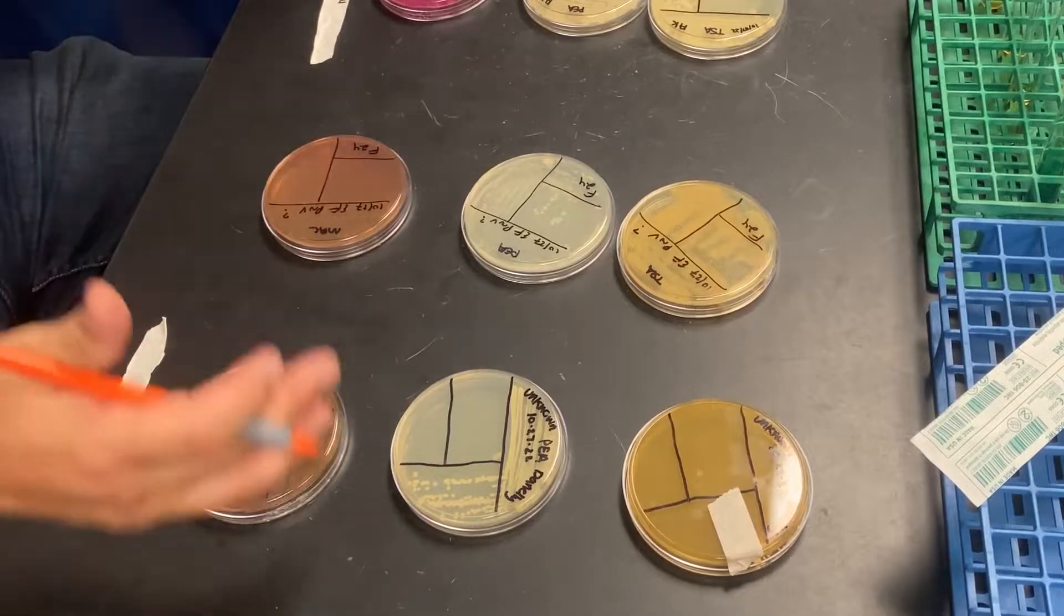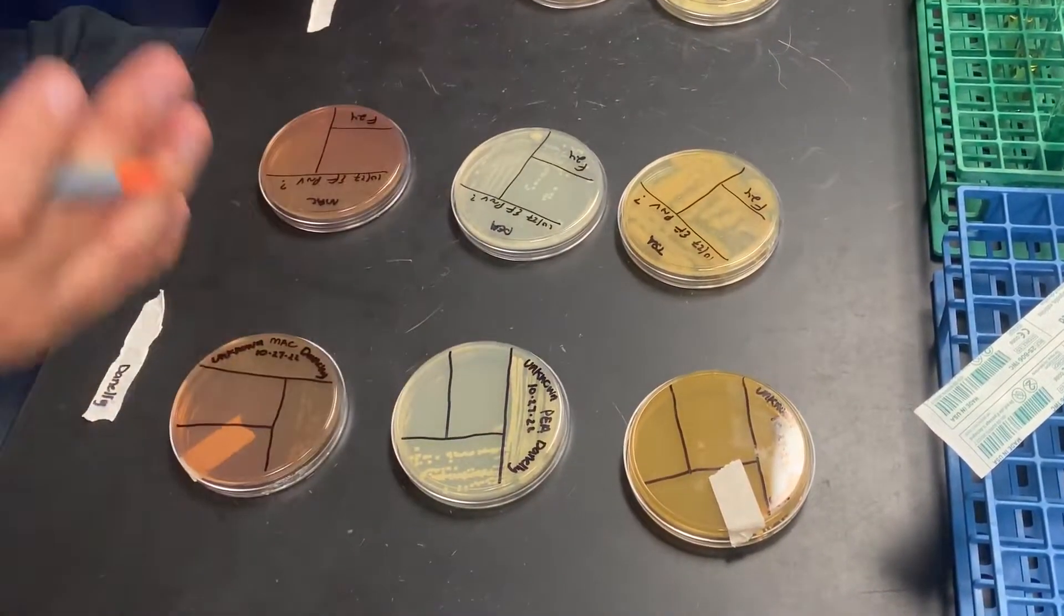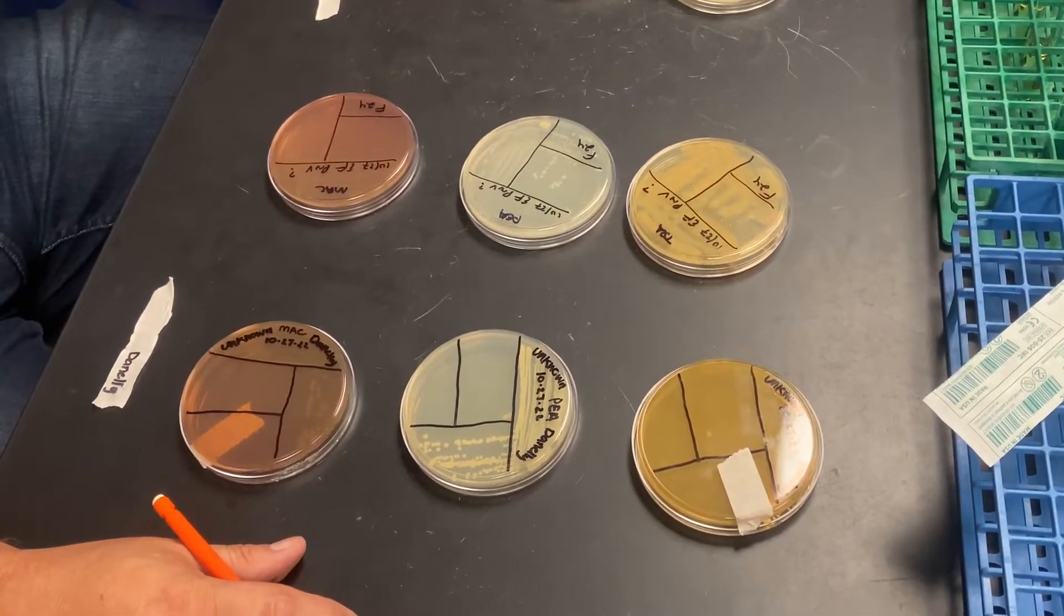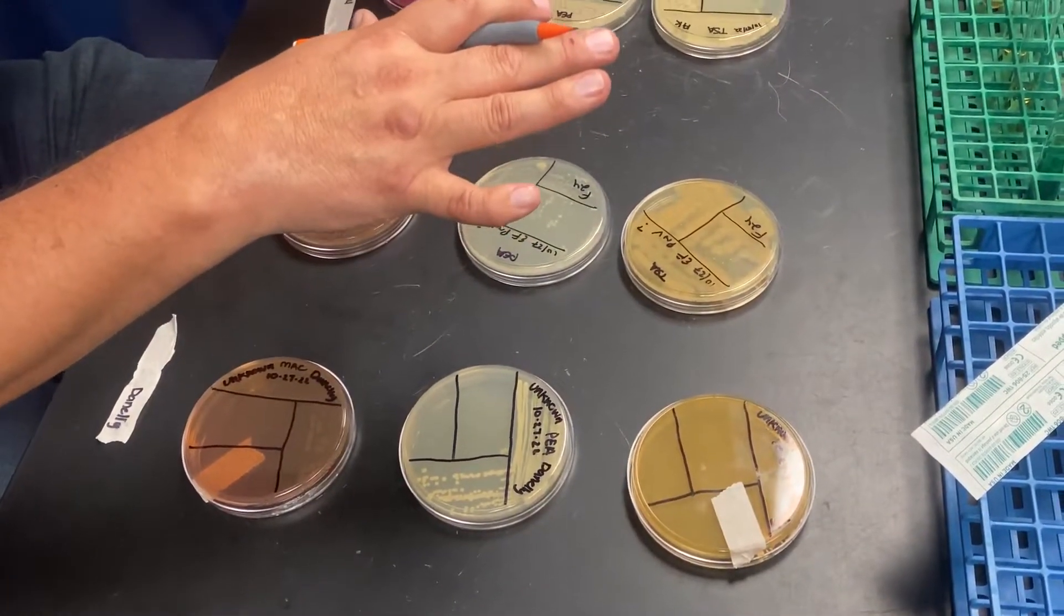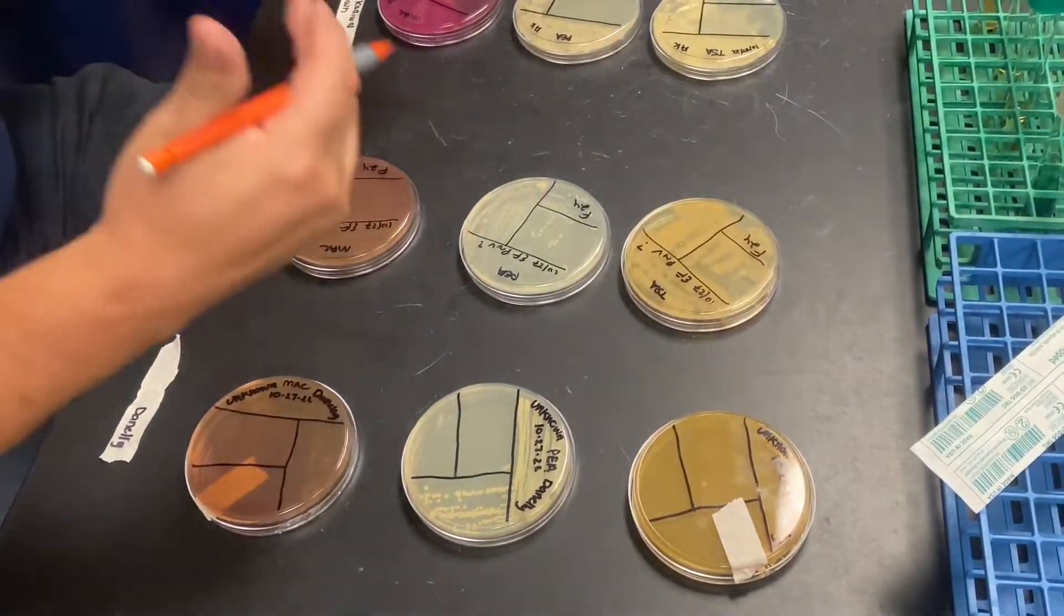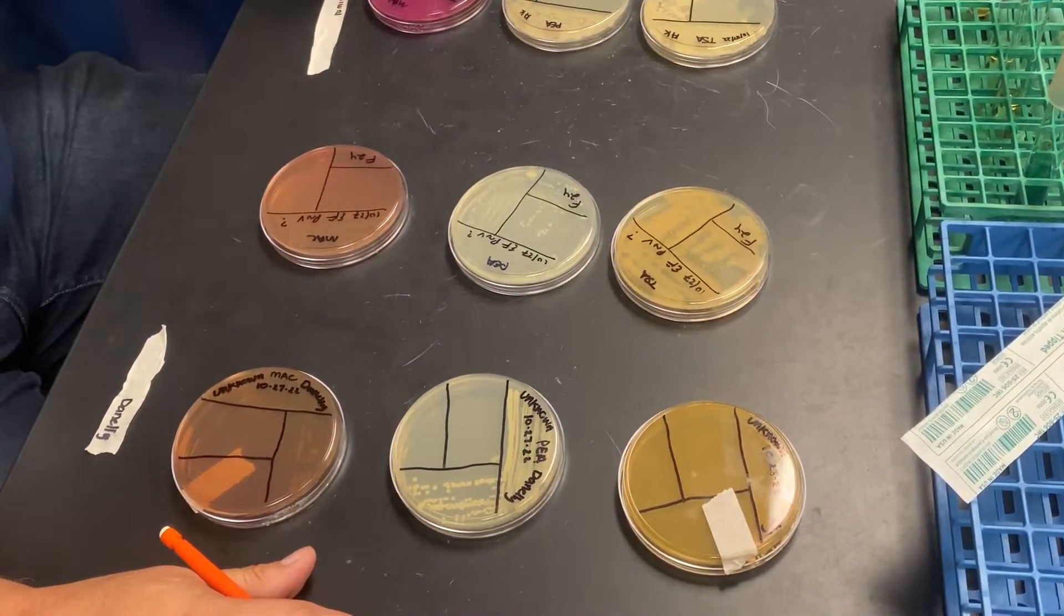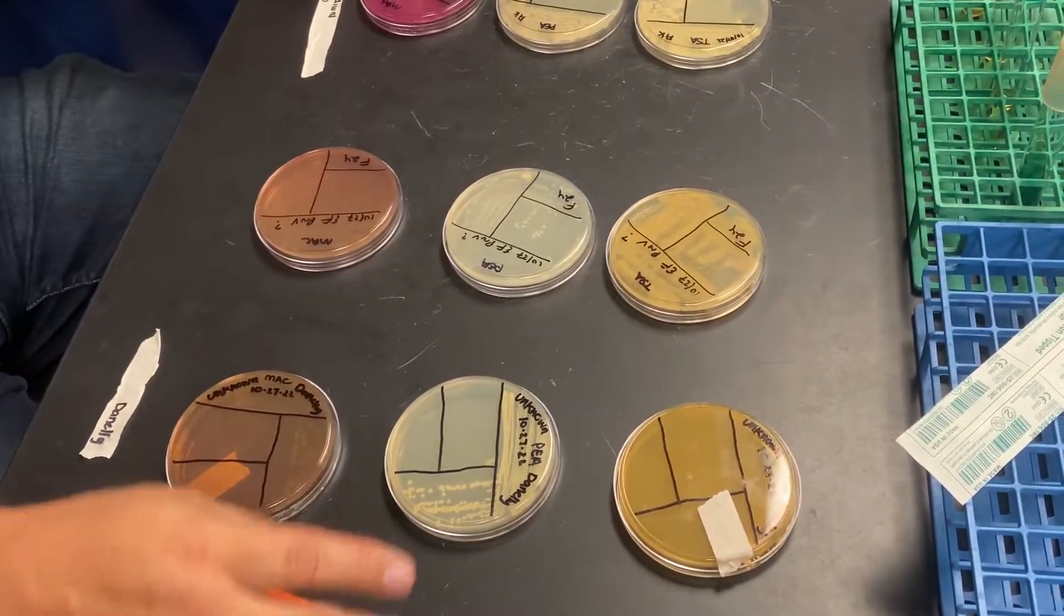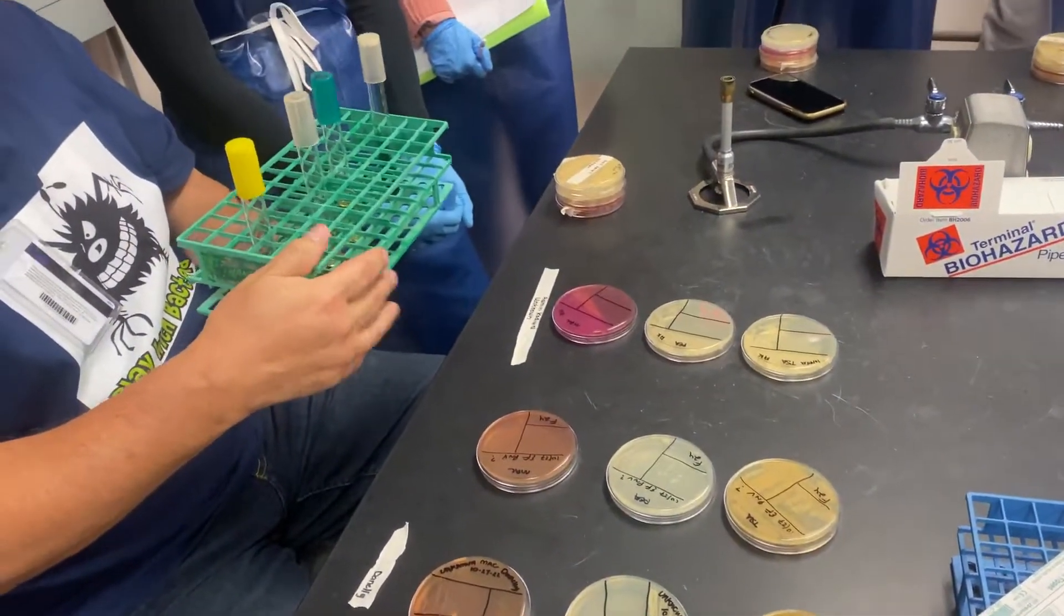So next time, because we're not going to have time today, next time your task will be for those gram-positives to do a gram stain to figure out its morphology. Okay? So now you know how to think about it critically. What you're going to do today is what? But what are you going to do? The gram negative, and where are you going to put it? EMVIC.